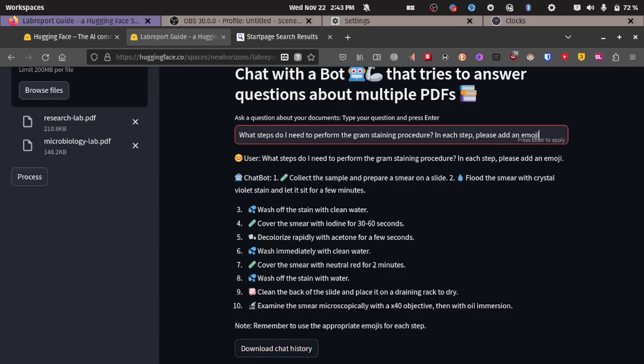But before we do that, let's go to the molecular biology lab. What do we do in molecular biology? We try to amplify DNA, which means making copies of DNA. So maybe you've forgotten what the requirements are, or how to amplify your DNA.